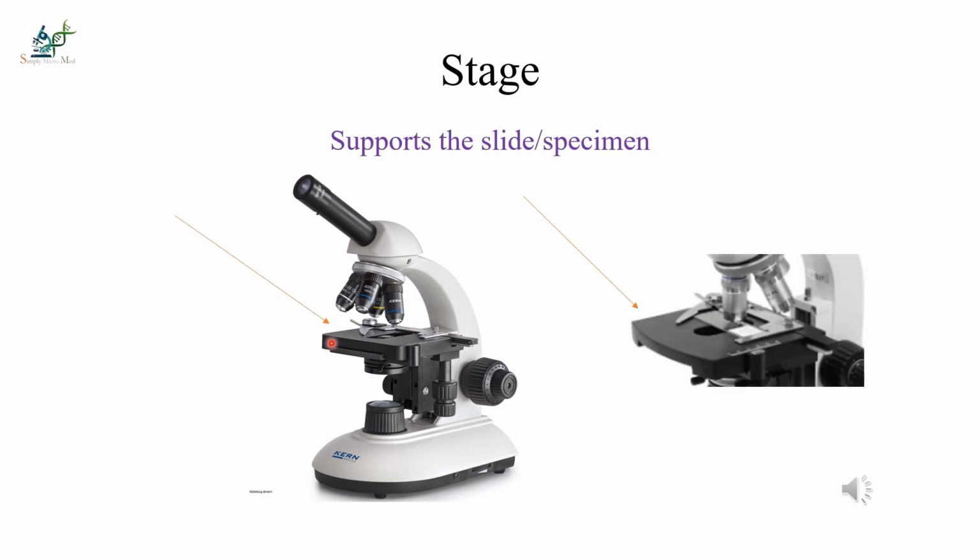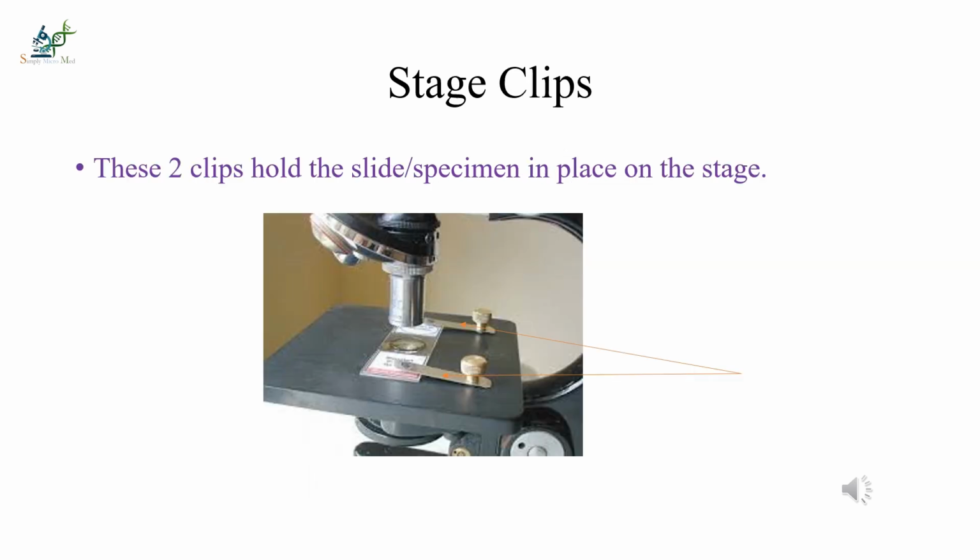And this is the stage. The stage will support the slide, and here on the stage we keep the specimen. Stage clip. These are two stage clips that hold the slide or specimen in place on the stage, and simply the stage clip will hold the slide.